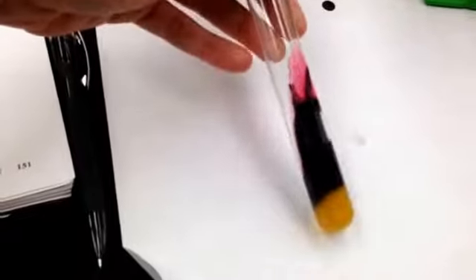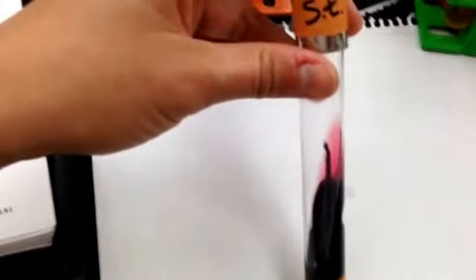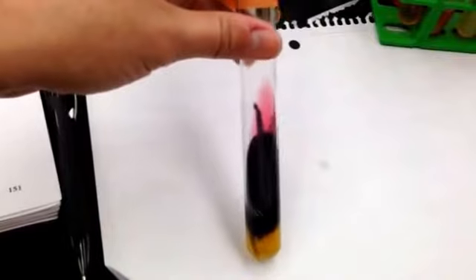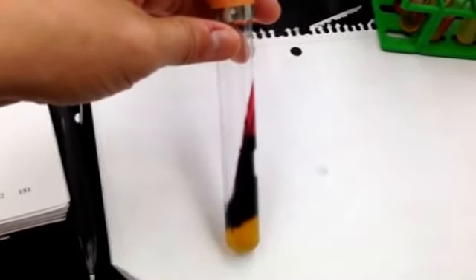It is yellow on the bottom, and there is a gas bubble, indicating that it produces gas and that glucose was fermented. I was incorrect at the beginning of my sentence. Glucose was fermented, lactose and sucrose were not fermented by Salmonella typhimurium. So this is the multicolored tube with red, black, yellow, and gas.